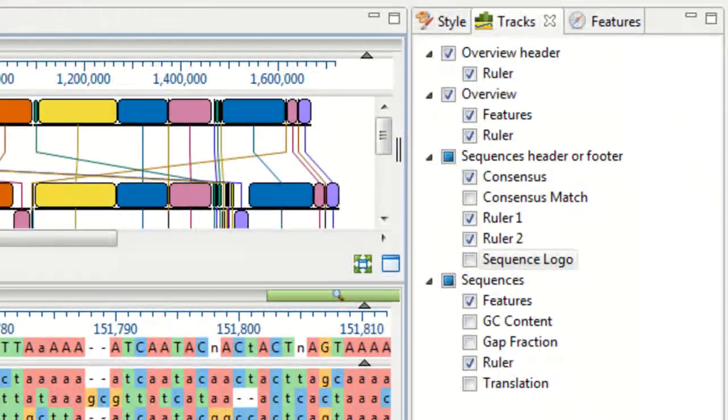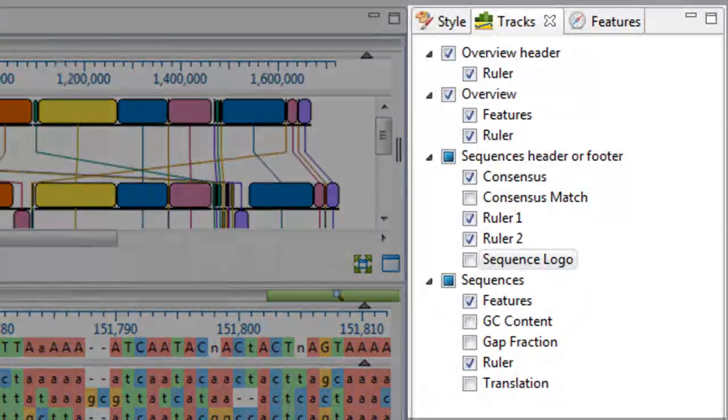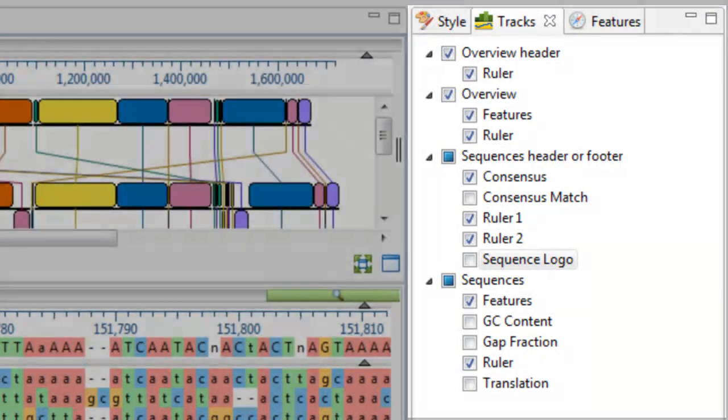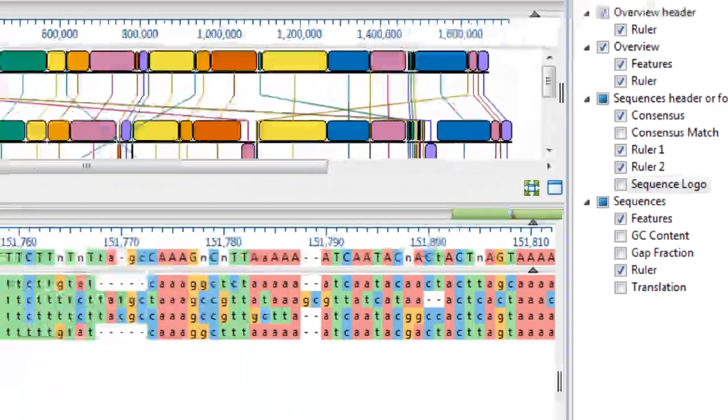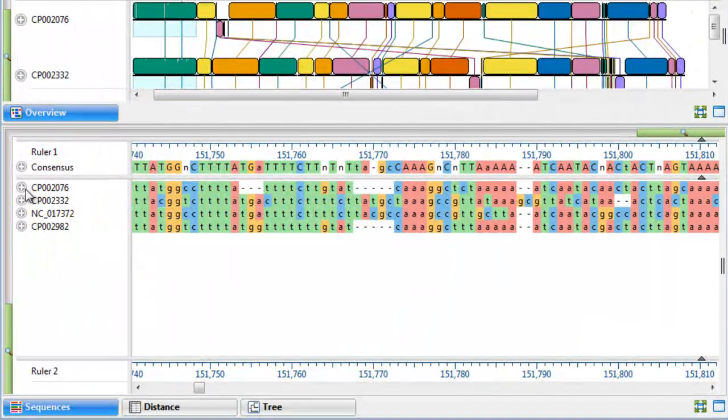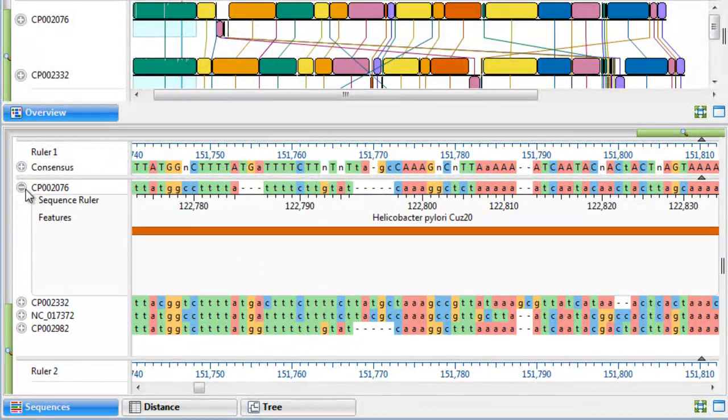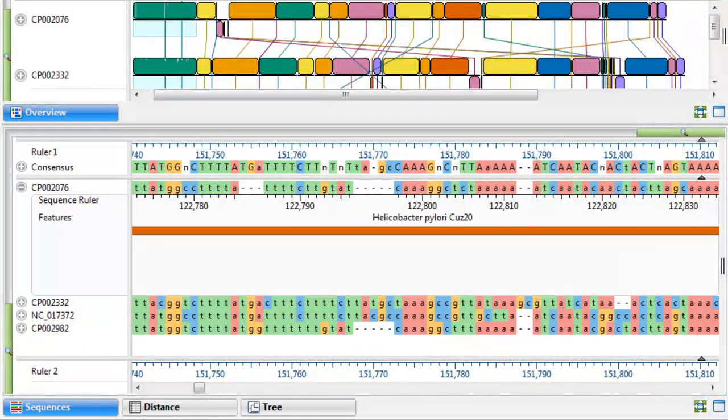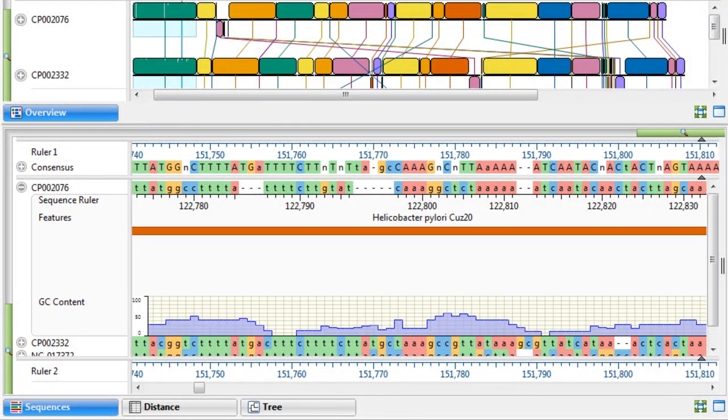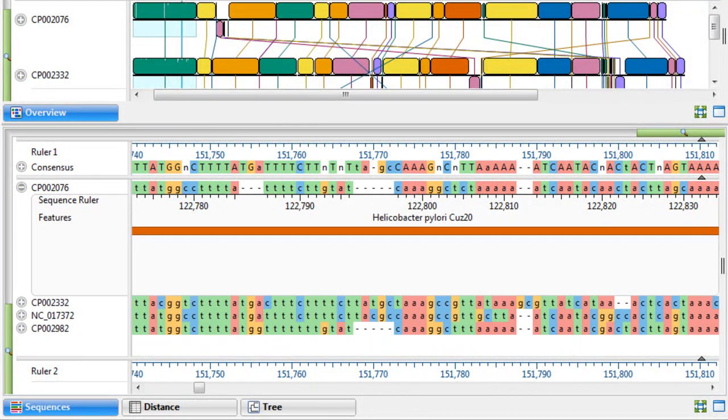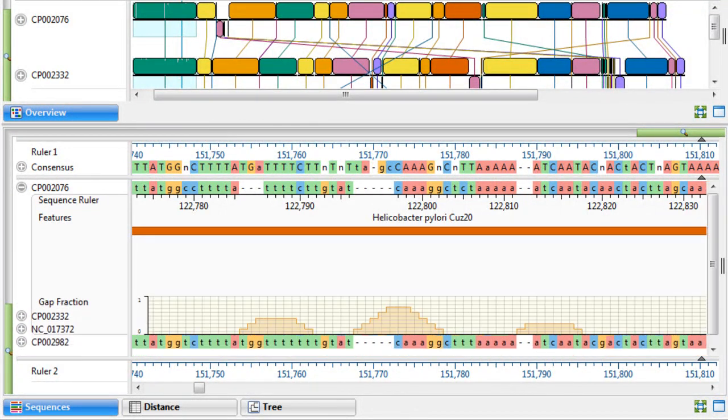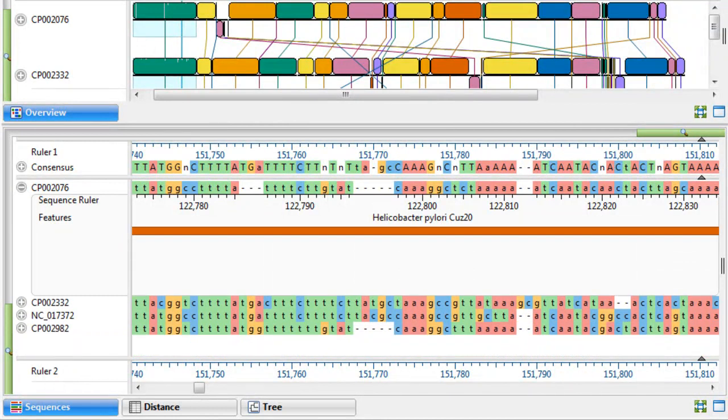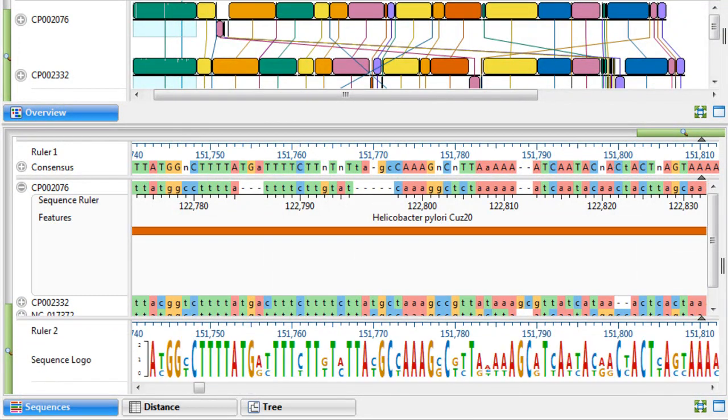You can examine all of your alignments using several different sequence tracks. These tracks include features, translation, GC content, gap fraction, and sequence logos.